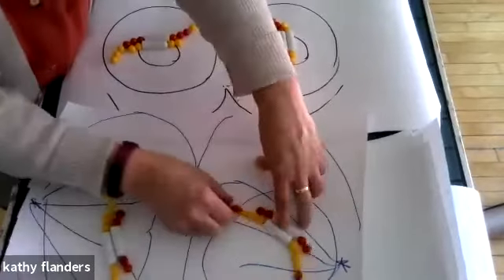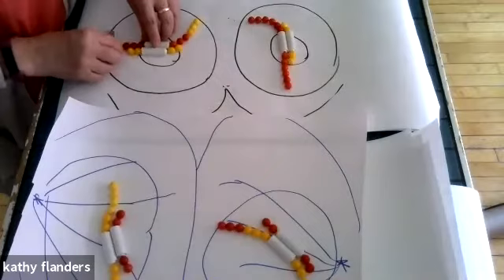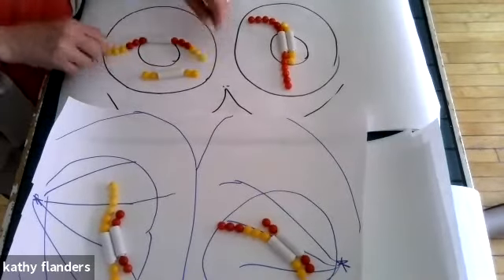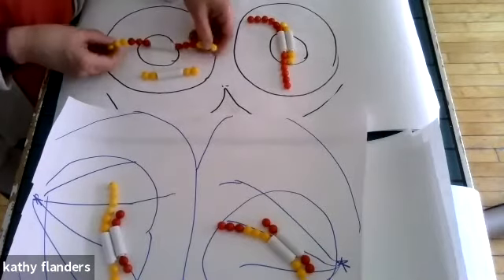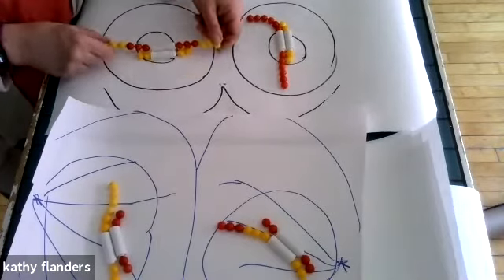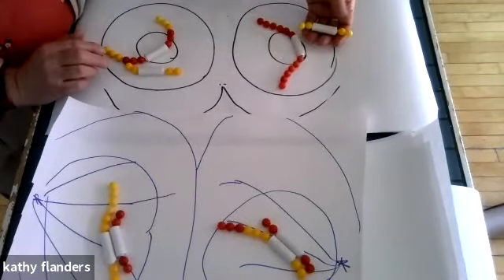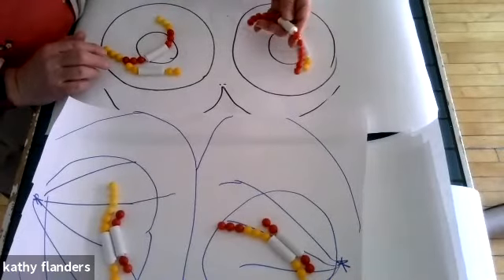It now is quite a combination. Here we have dad's chromosome 22 and mom's chromosome 4, and she's got a mixture of mom and dad on that chromosome. And then we have this one that has dad's chromosome 22 and mom's chromosome 4.